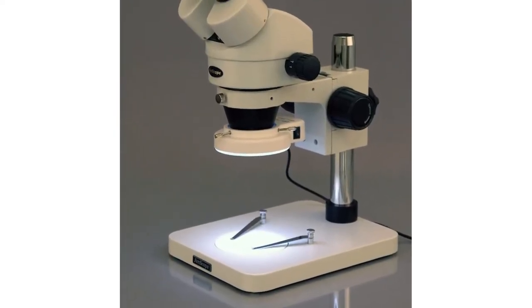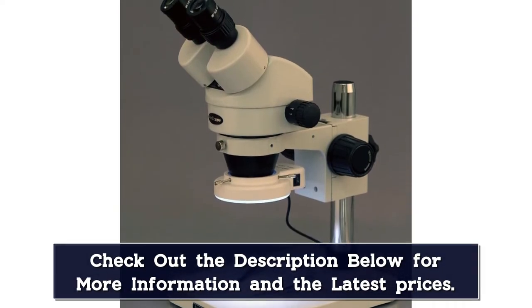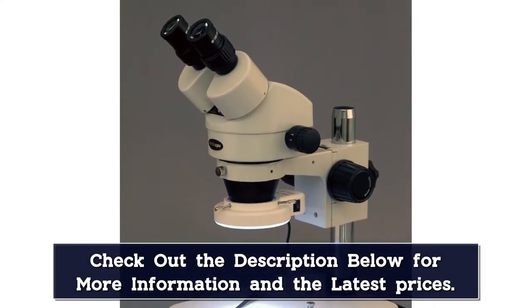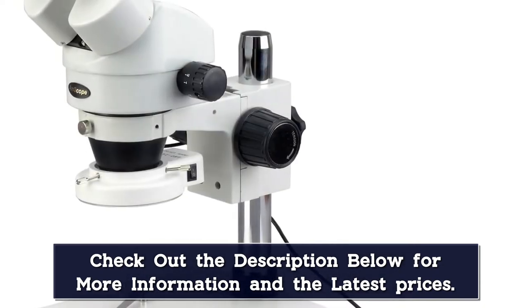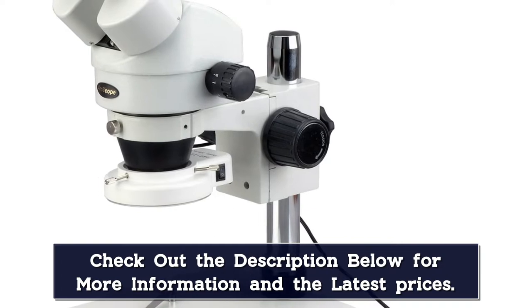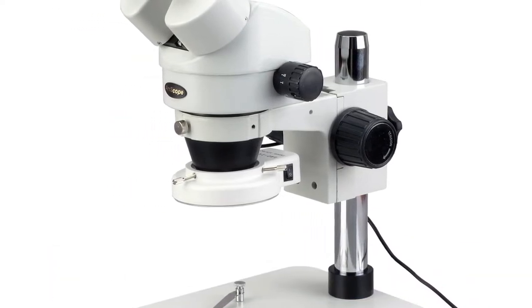Not all microscopes come with a stage plate, for example stereo boom microscopes, but most of them have a black and white side when they do. This design allows you to see better depending on the brightness of your subject. In some cases a black background makes it pop, while a white background might blend in too much.